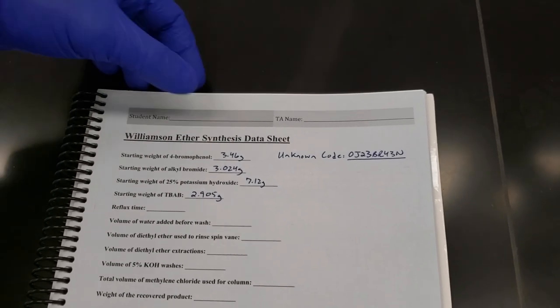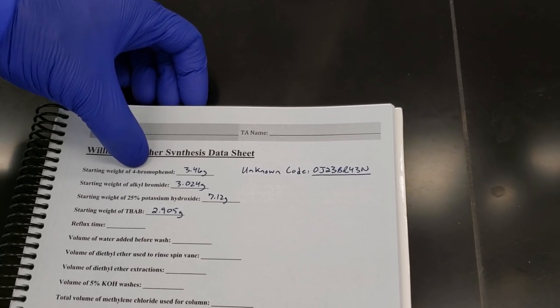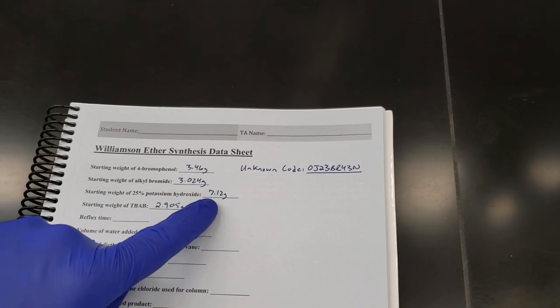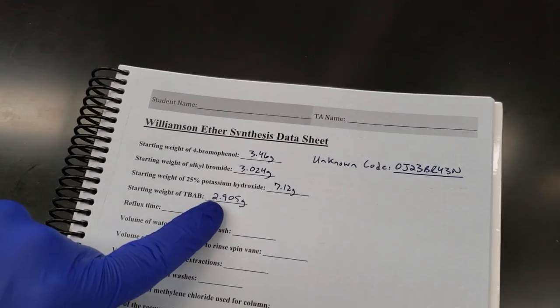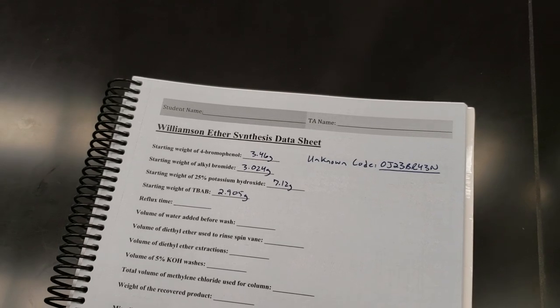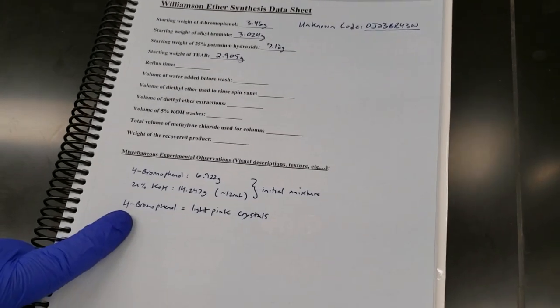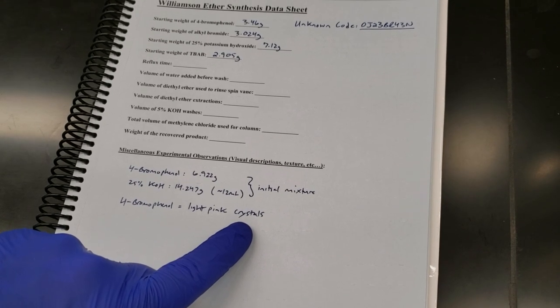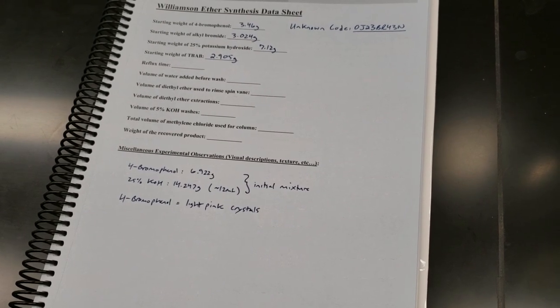We took 8 milliliters of that solution, which represents 3.46 grams of our 4-bromophenol, so that's what we'll use for our actual calculations, and corresponds to roughly 7.12 grams of our 25% potassium hydroxide solution. We weighed in 2.905 grams of our TBAB, and 3.024 grams of our unknown alkyl bromide. We recorded our unknown code. We also made an indication of the visual observation of our 4-bromophenol light pink crystals before they were dissolved into a light pink solution. So we'll head over to the microwave and get the reaction started.